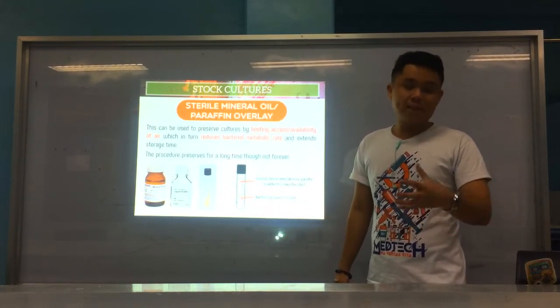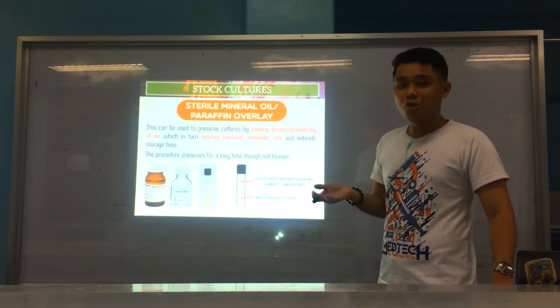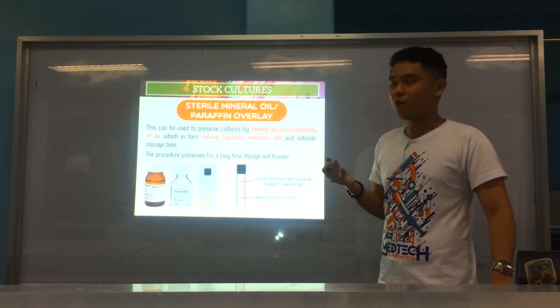promote or to limit the access of the bacteria to oxygen. Okay, para dili sila magpadayon mag-grow and multiply. So ma-preserve ang growth. Okay, all right.